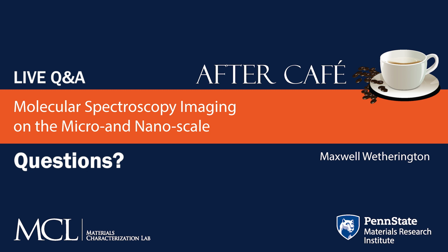I'm coming from a natural science side of things, and I'm interested in these newer techniques. It's awesome that they're smaller. Have libraries of standards, like for minerals or for natural compounds, been made of these, or for applying to in situ samples? What's the state of that? Where you don't know what's in them.